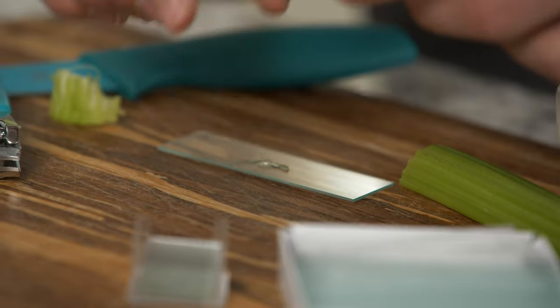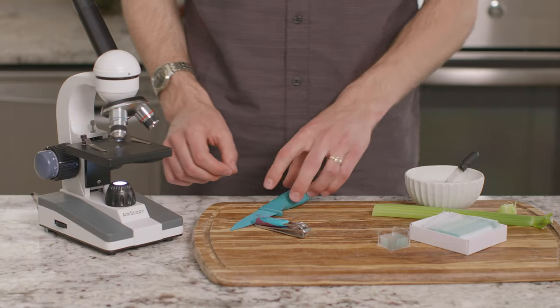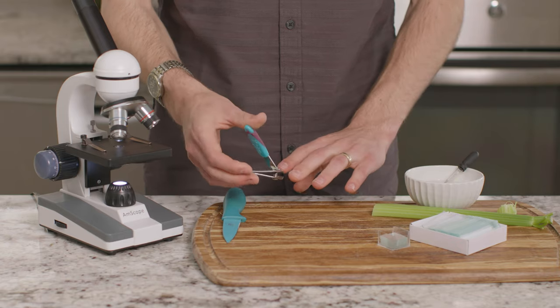Our slide is ready to view, so let's take a look. Now let's prepare our next slide. I'm going to use these clippers to trim a very thin piece of my fingernail.